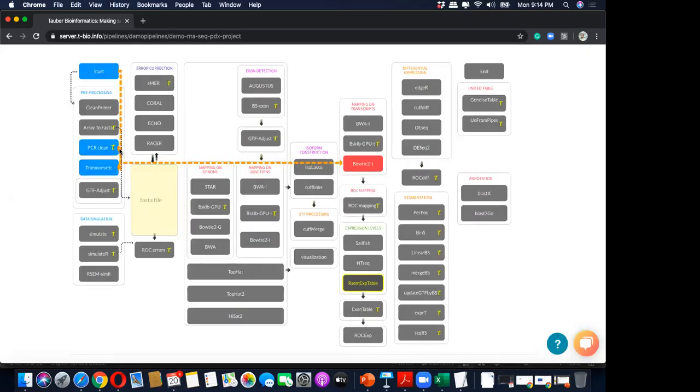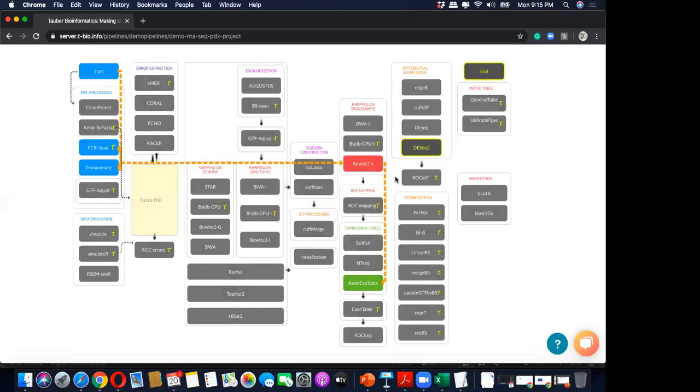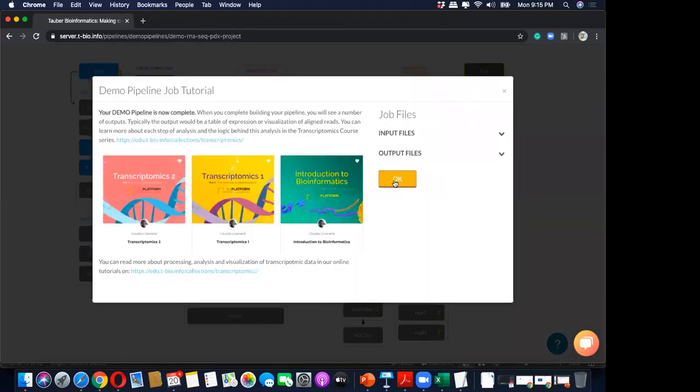So after doing pre-processing, we are aligning it to the transcripts, and then we are generating a table of expressions. Differential expression is something that we will be learning in the next class, which is another important aspect and has been used widely in research. So we'll be covering those and some of the statistical techniques, which are very important to further analysis. So let's end this.